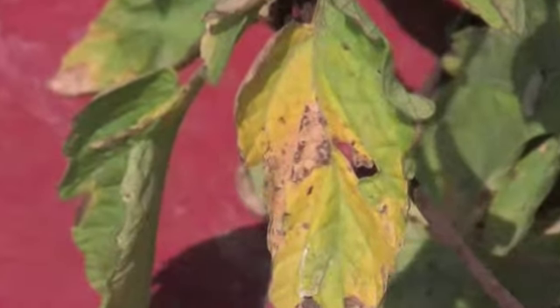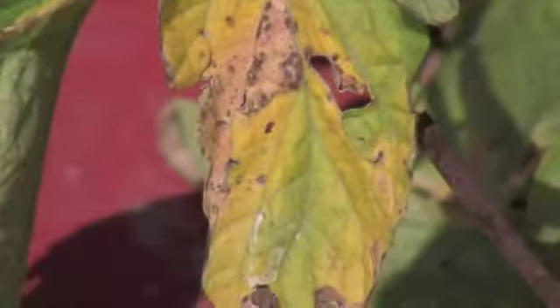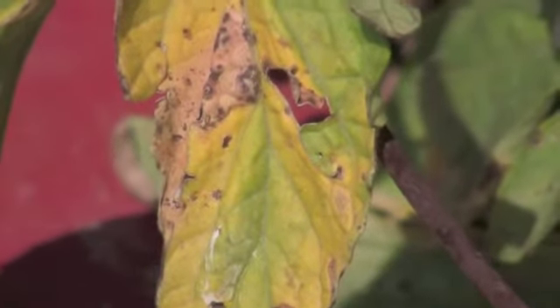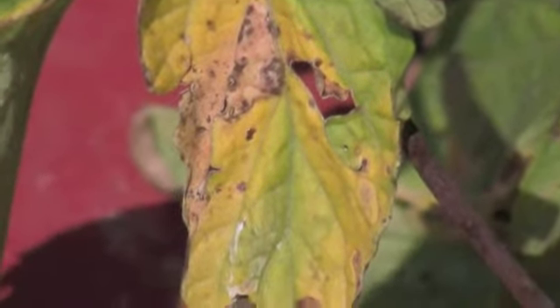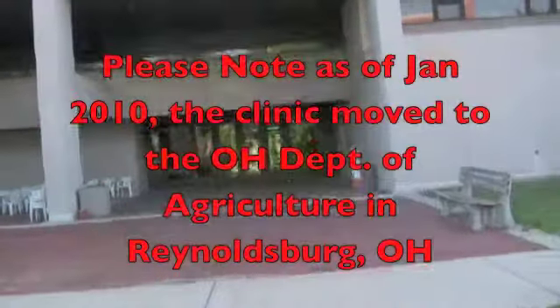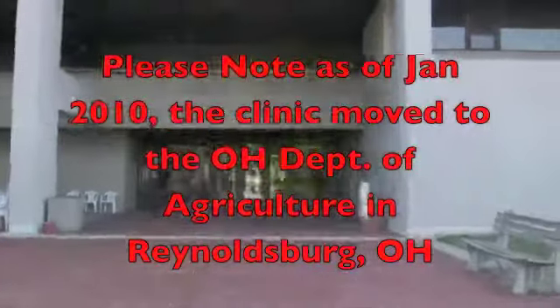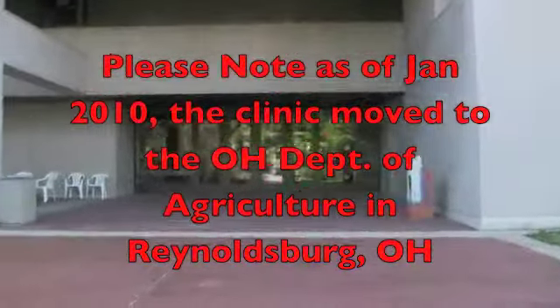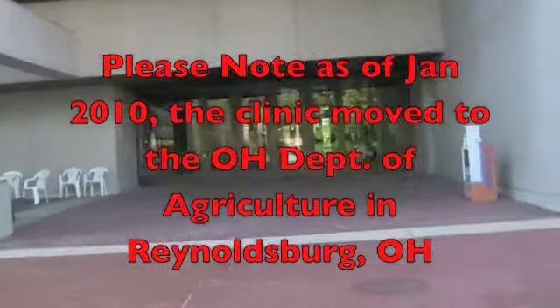Here you can get a better idea of the spots we're talking about. As you can see, some of these have coalesced together to form necrotic or dead areas on the leaf. There are also some necrotic areas along the edges of the leaf which we want to get checked out in the clinic. The clinic is located on the west side entrance to Cotman Hall on the Ag campus, and today we're going to get a behind-the-scenes look at what goes on in the diagnostic process.